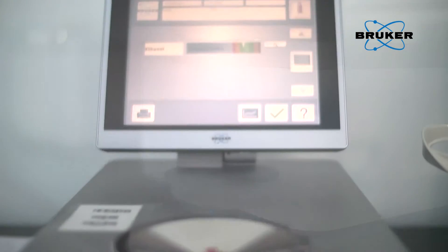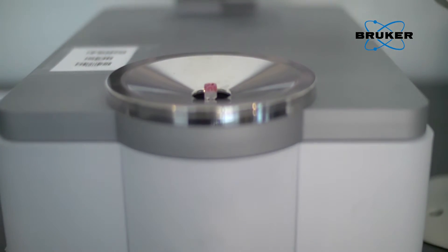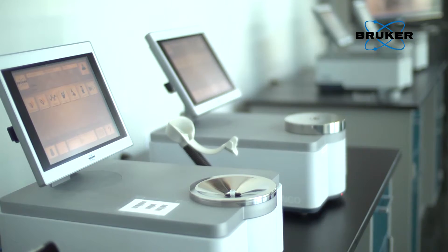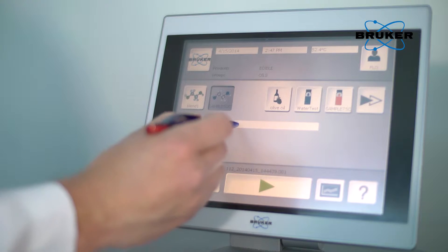With Tango, your NIR analysis speeds up. Tango has exactly what users require of an FT-NIR spectrometer suitable for industrial use: robustness, high-precision, and straightforward operator guidance.